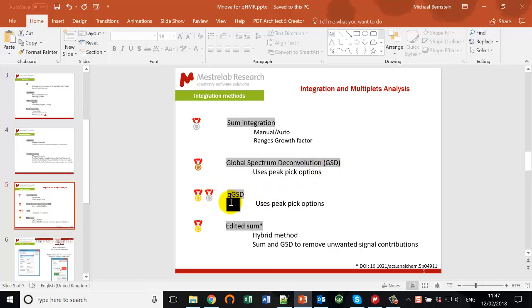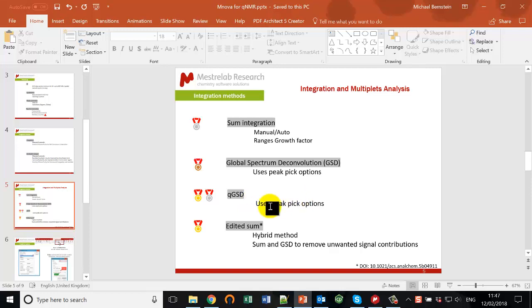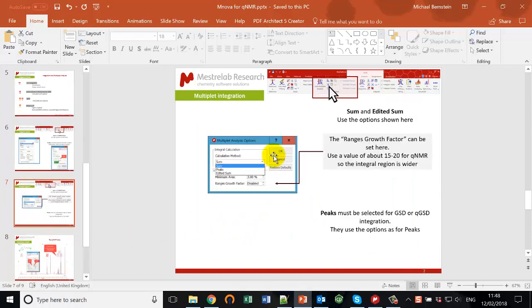QGSD is a variant of GSD that has been optimized for quantification — hence the Q — and operates to a much higher level of performance. Finally, the edited sum method was developed in collaboration with the BKA, and when you have the very highest demands and want to get things really perfect, this is the one for you. Within integration, these methods have a dependency on the peak picking options, which I'll go through later in the video. Similarly for multiplet analysis, you can choose various options and set the ranges growth factor there as well.